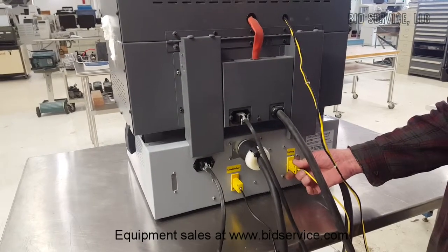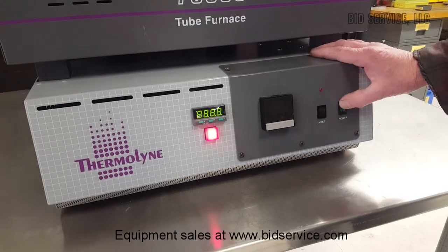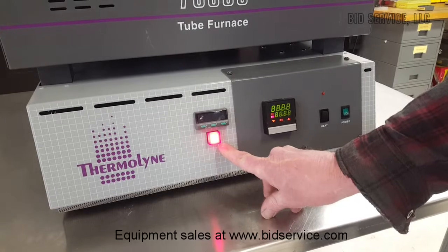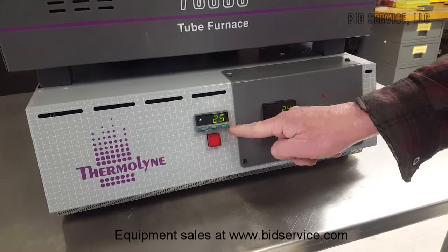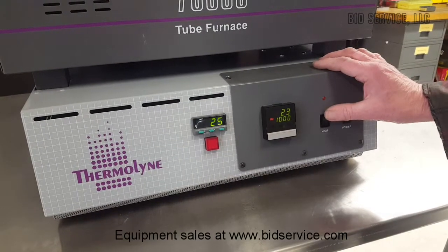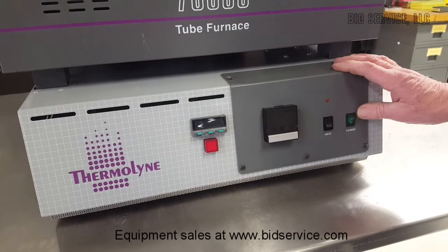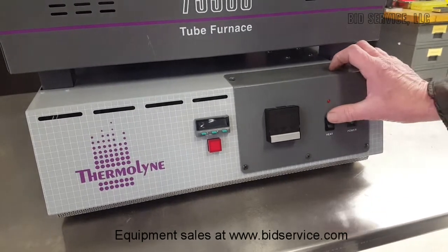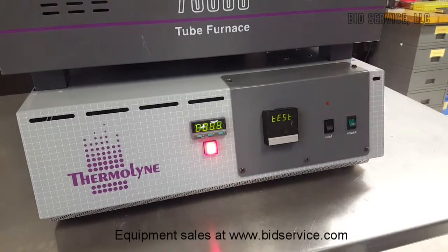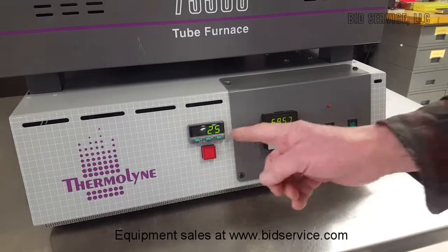Now we'll return to the front. We'll turn our system on. When the system first comes on, you'll notice that this red light is on — that's the over-temp light, and once the controller sets, it turns off. As long as that light is on, it will not allow the heaters to turn on. For example, when I turn the unit off and back on again, notice the heat switch is on, but the heaters did not come on until the over-temp sensor sets.